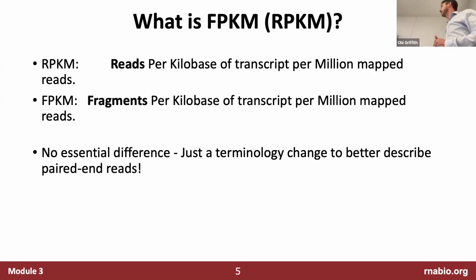So one is that genes are different sizes, right? If you have a big gene and a small gene, and you randomly fragment both and then sequence from them, you'll get more fragments from the big gene, because it's bigger. So you can't just count the reads and say this gene is more highly expressed, when actually it's just bigger. So you have to deal with that problem somehow.